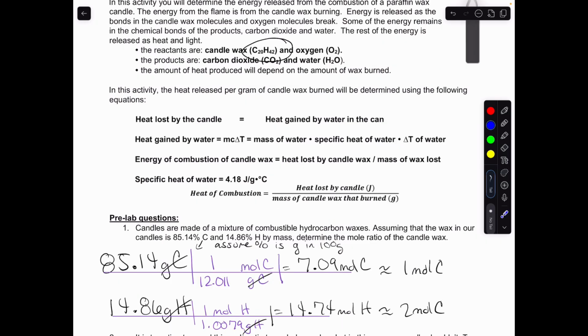For the experimental determination of the bond energy of paraffin, which is a type of wax. So in class, we've been using a table of average bond energies to calculate the bond energy for chemical reactions. Here, we're going to do that same thing, but experimentally. It's a different technique: as we break the chemical bonds in the candle, that heat energy will be released to a can of water.